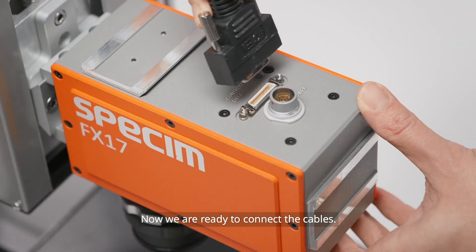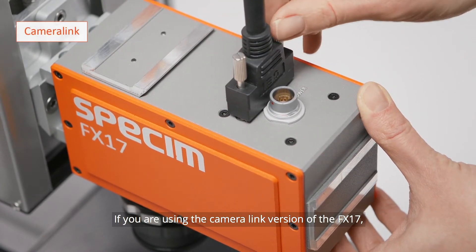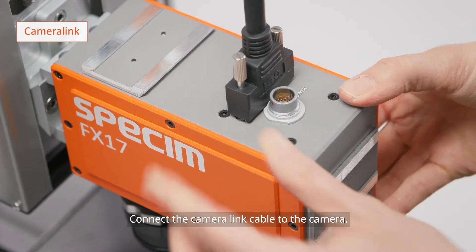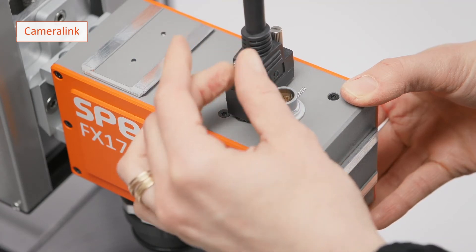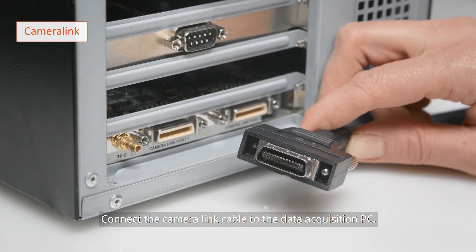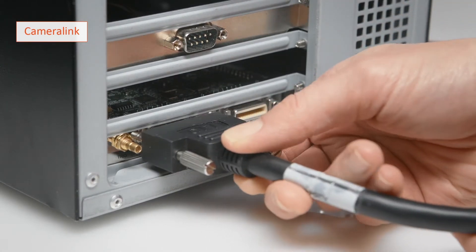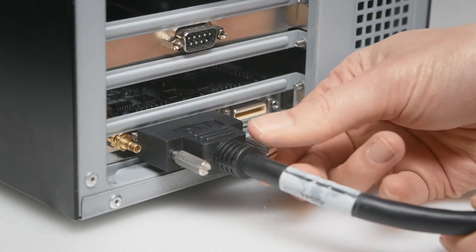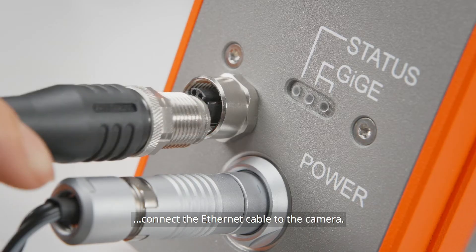Now we are ready to connect the cables. If you are using the CameraLink version of the Specim FX-17, connect the CameraLink cable to the camera. Connect the CameraLink cable or Ethernet cable to the Data Acquisition PC. If you are using the GigE version of the camera, connect the Ethernet cable to the camera.